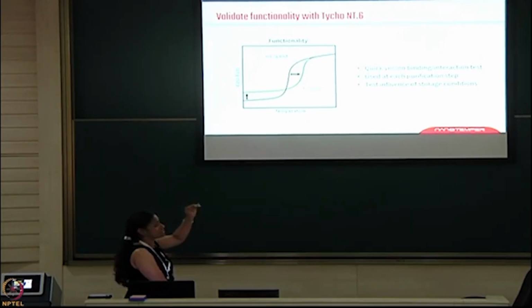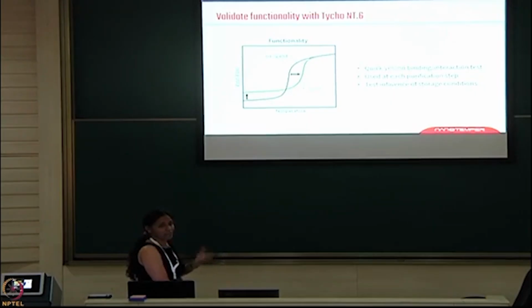If it is a positive shift, that means it is a true binder. If it is a negative shift, that means it is not a true binder. We can actually go for a yes or no on whether the shift is happening, whether the interaction is possible or not. With this, you can go for further assays, like SPR or ITC. You can say, okay, this protein with this ligand is good because there is a thermal shift, because the TIs are shifting here.